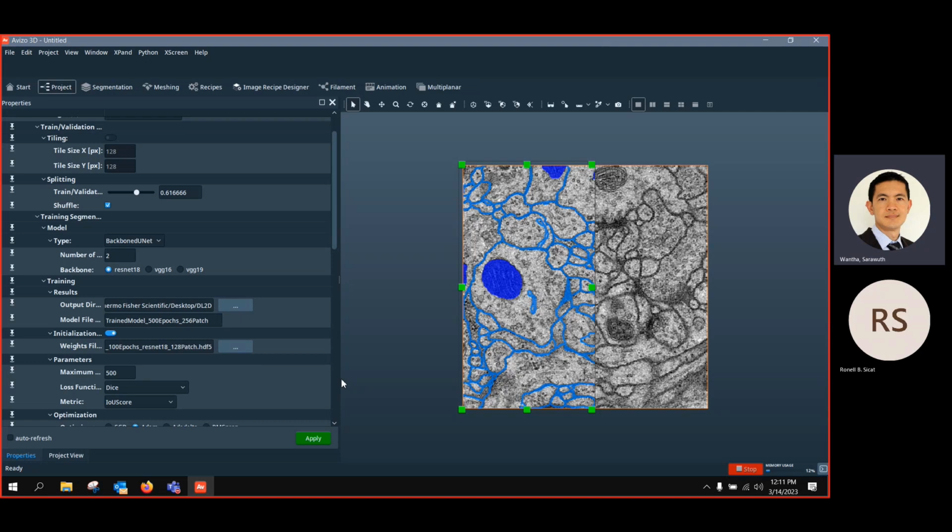But it should be at least the same kind of feature that you're looking at. Yeah, exactly. But at least when you do the training, you have to have the same dimension. I think you just crop them. Yeah, technically it could be possible, at least if you want to look for the same kind of structural feature in your training. Yeah, exactly. So it's only the parameters that you have to fine tune. But in terms of input image, as long as you have good segmented images that have the feature you're looking at and are precisely segmented, then you're going to get better results.